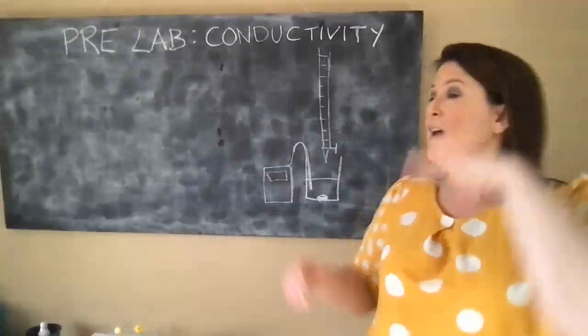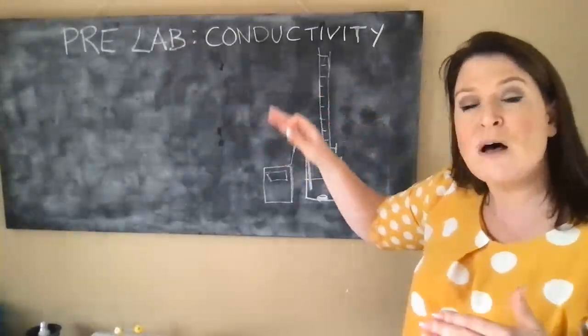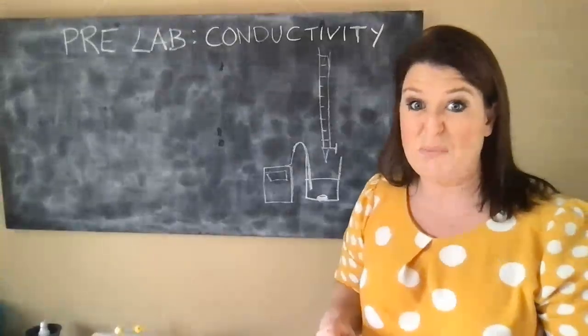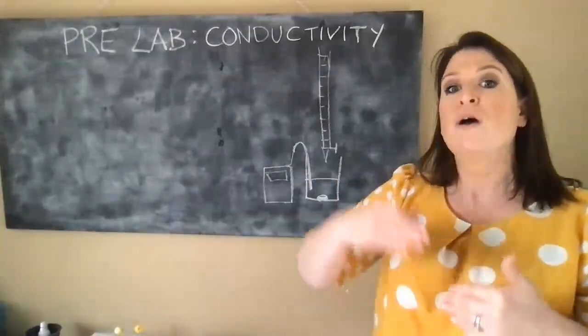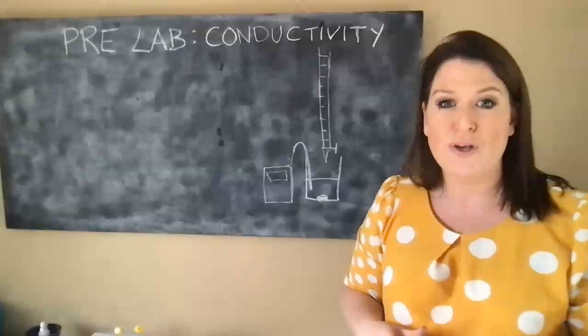So if you've gone from, say, 10 mL to 11.5 instead of to 11, that's fine, because on your graph at the end, just make sure that you say, well, I did add 11.5 instead of 11, but this is the corresponding correct value that goes with 11.5. Don't pretend that it goes with 11, because it will skew all your answers.